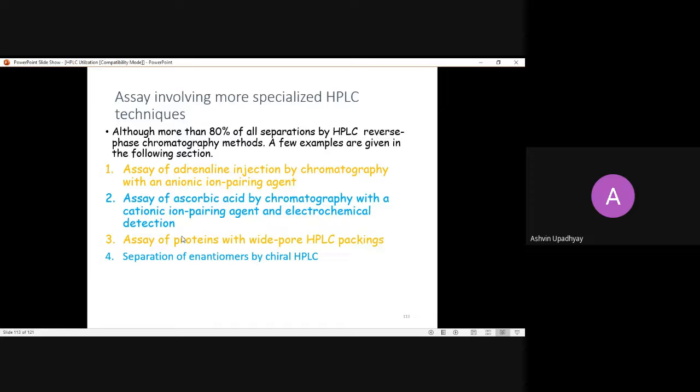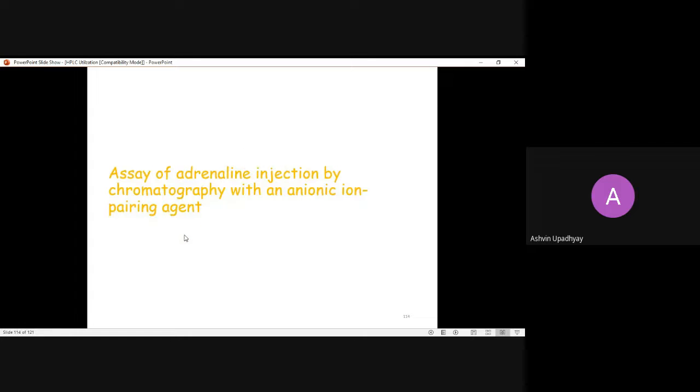So I hope I have covered all of the major techniques and assaying of all quantitation of formulated drugs, either single, in a combination of drugs, or in a cream with a combination of chloride, phosphate and other entities.